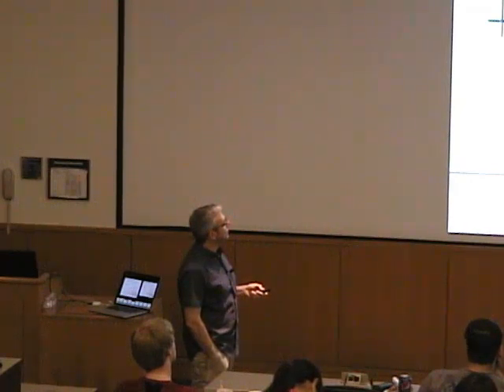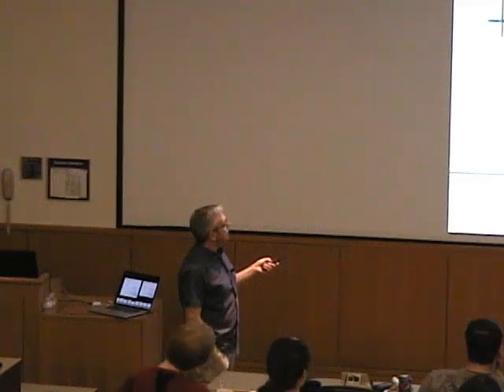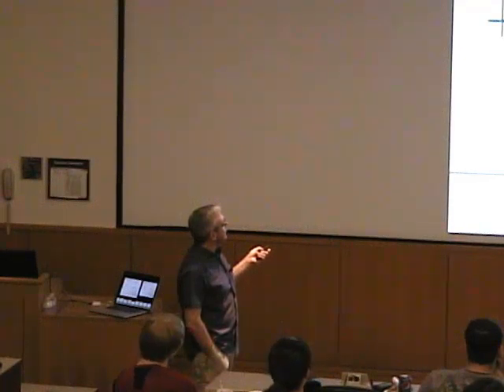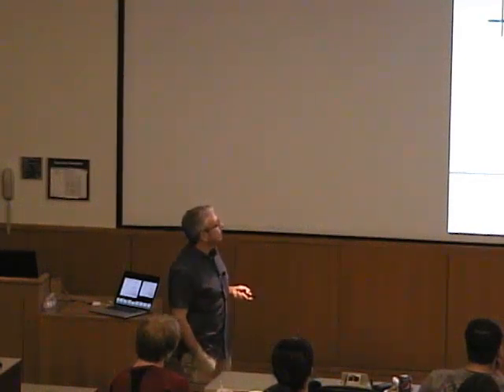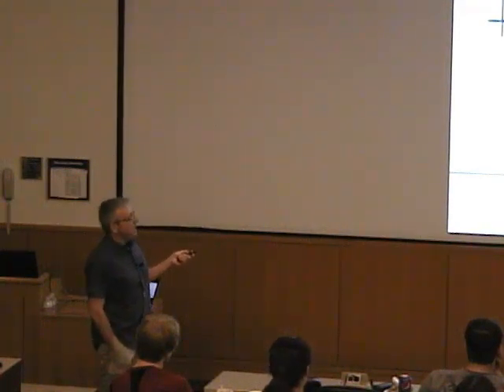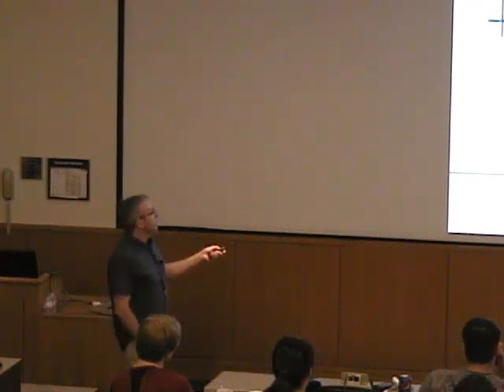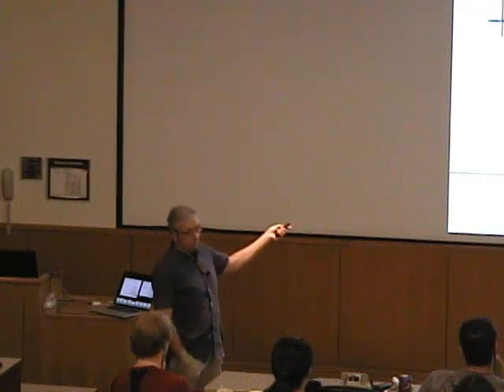That vector would be here and here. That vector would be here and here. And that vector would be here and here. So the Patterson map would generate n squared peaks. N of those fall in the origin. They are peaks from each atom to itself. And the others are there. That's what you can calculate, while that you cannot calculate.